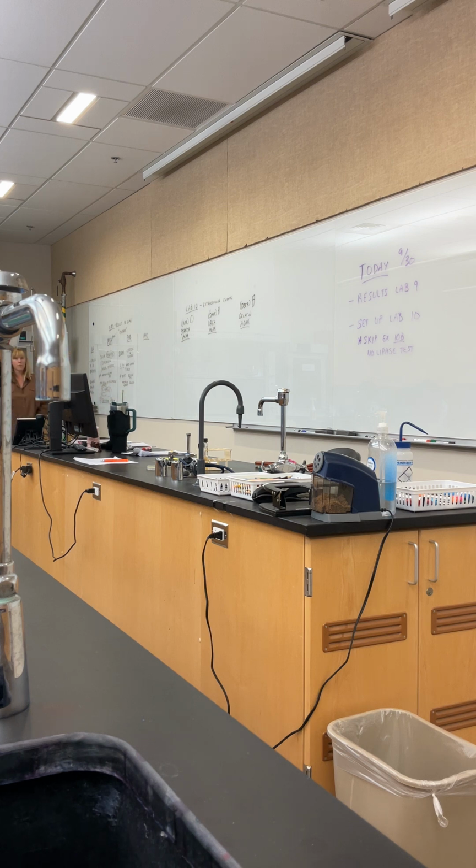Okay, the other organisms that we set up on this plate, we set up our Staphylococcus epidermidis and Staphylococcus aureus. Did either of those grow? No, good, they shouldn't grow. And the reason for that is, remember, we have methylene blue in here. So methylene blue and eosin are also dyes.